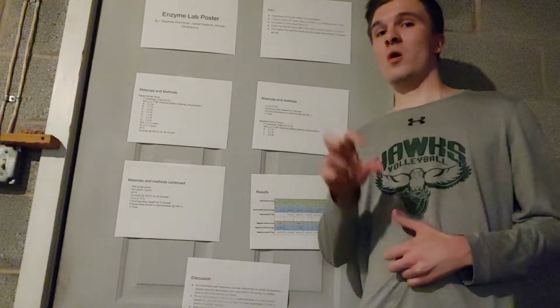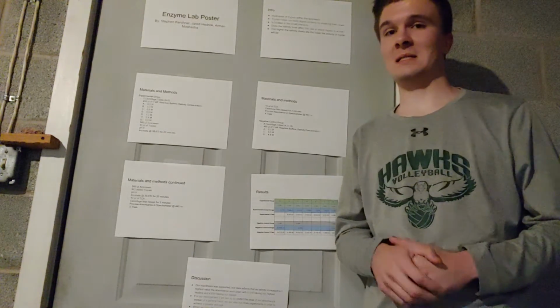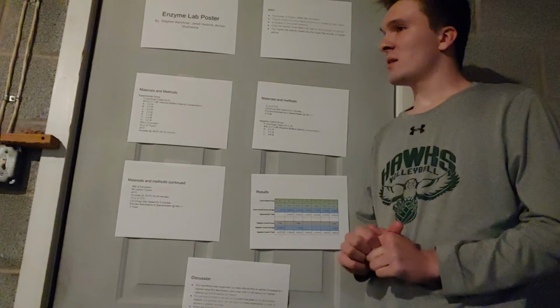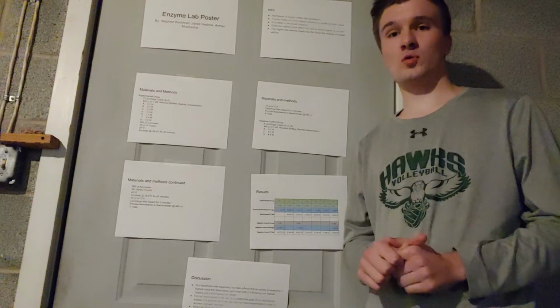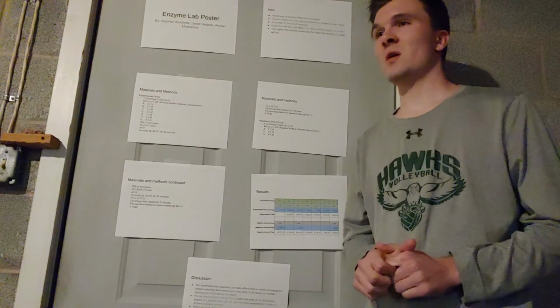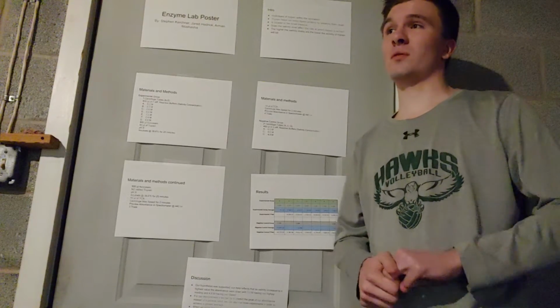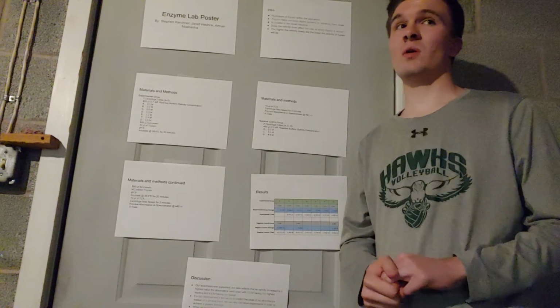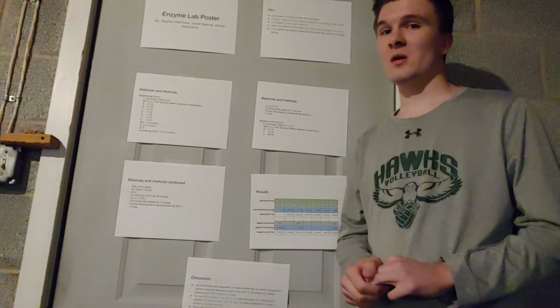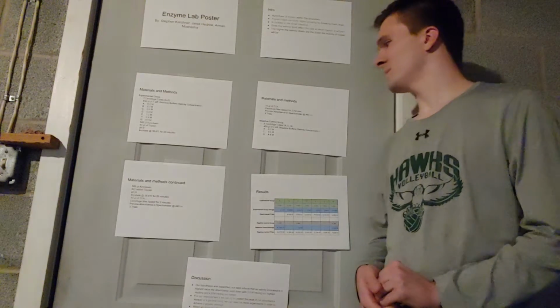We're not worried about all of the extra products that the trypsin and the azocasein create inside of our centrifuge. We did 4 trials of that, and we found it useful to do 4 trials because with 2, if there's a varying result, you're not sure which one it is. And for 3, you can have 3 varying results, but getting an average if you have to get rid of one is not possible. So we did 4 just to be safe, and we'll get to why we can do more later.